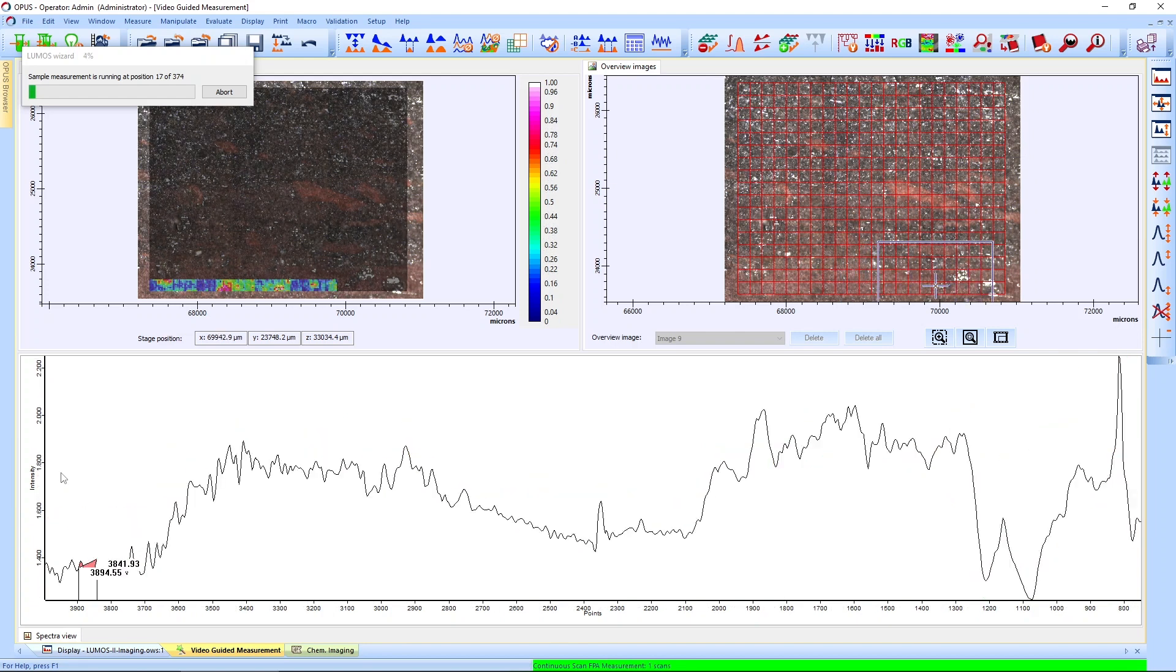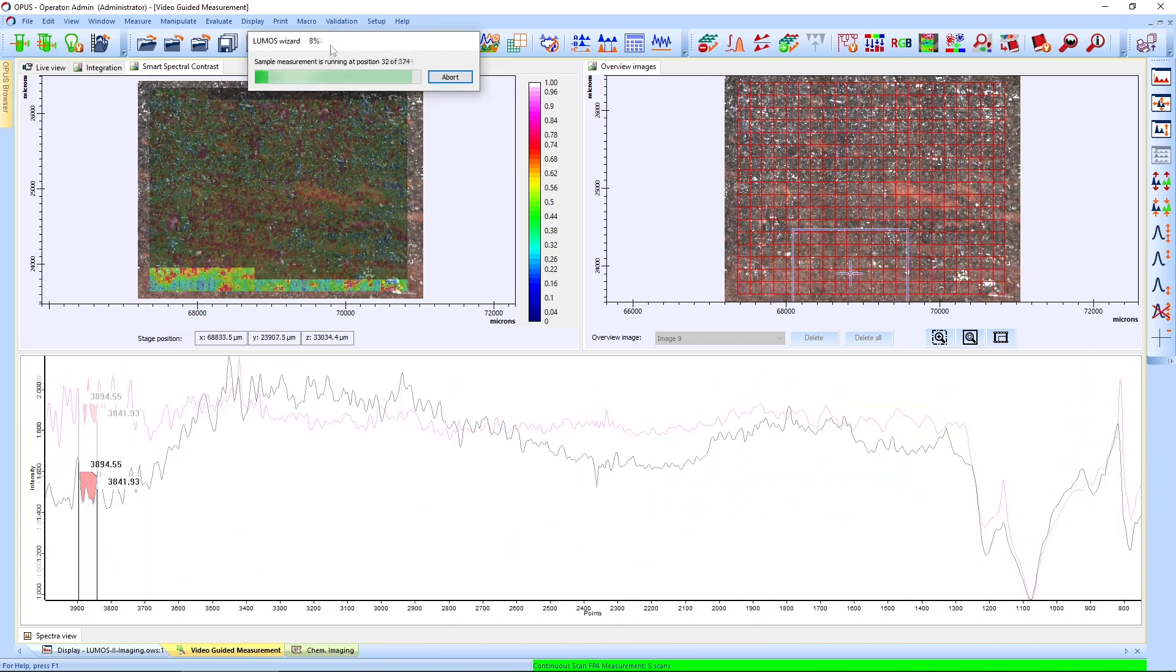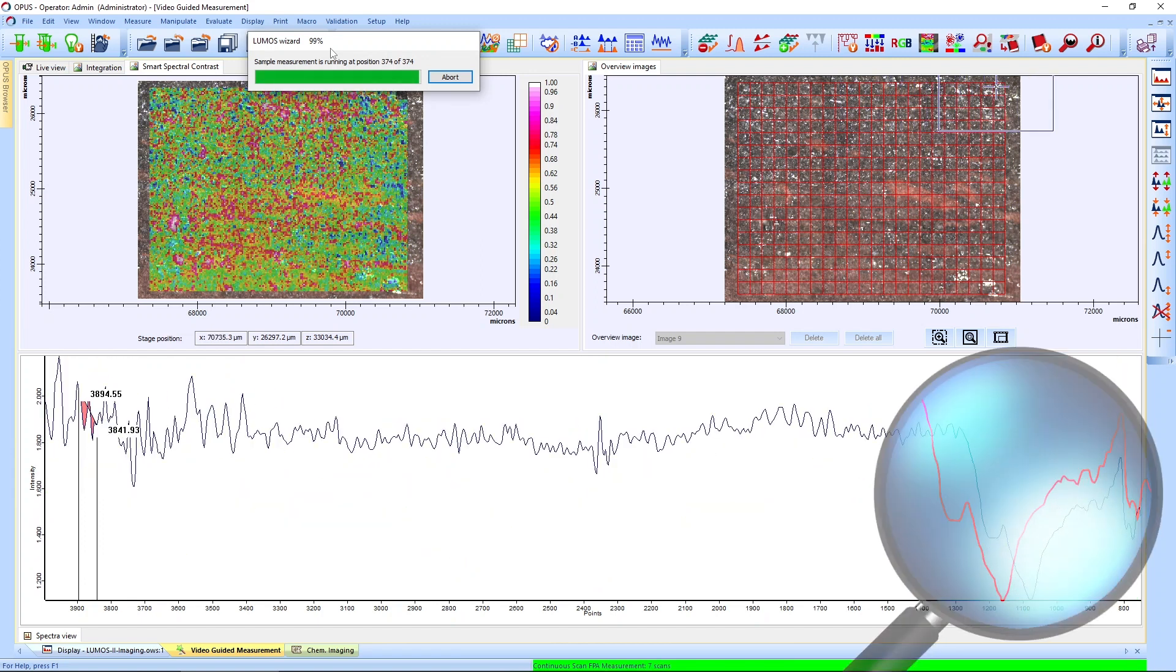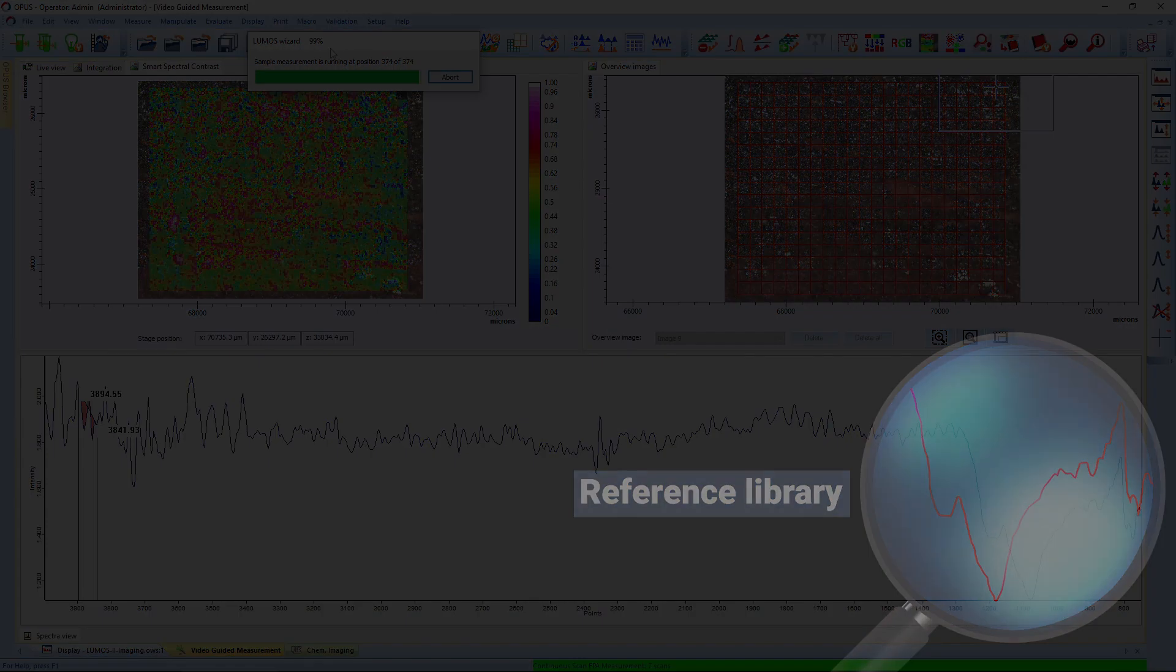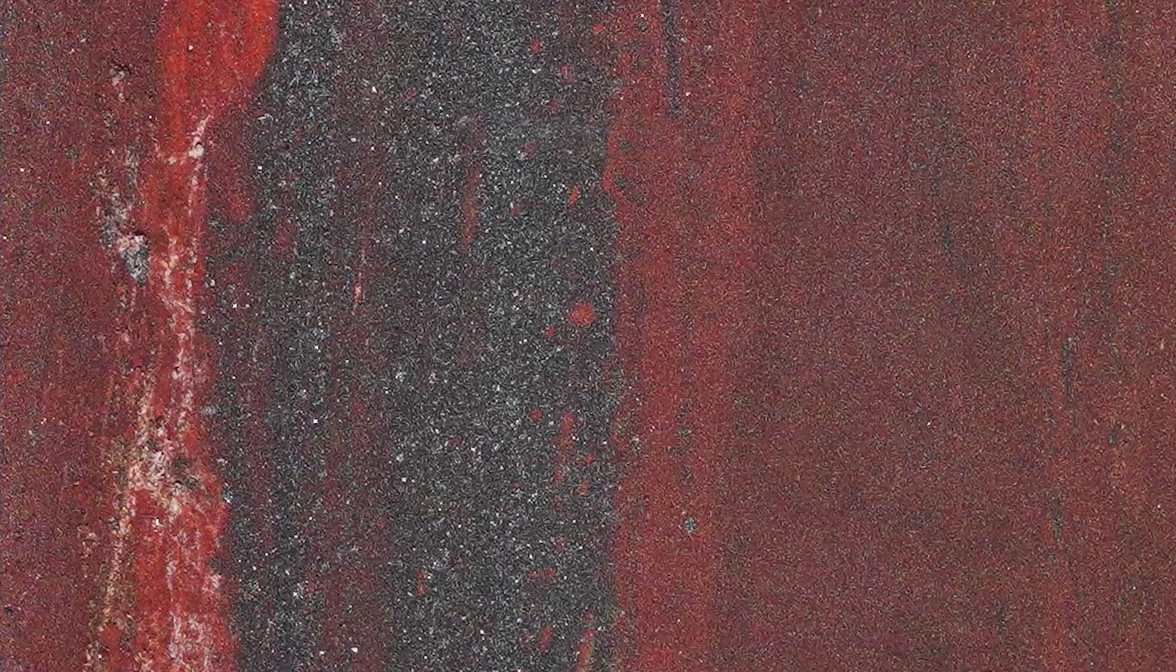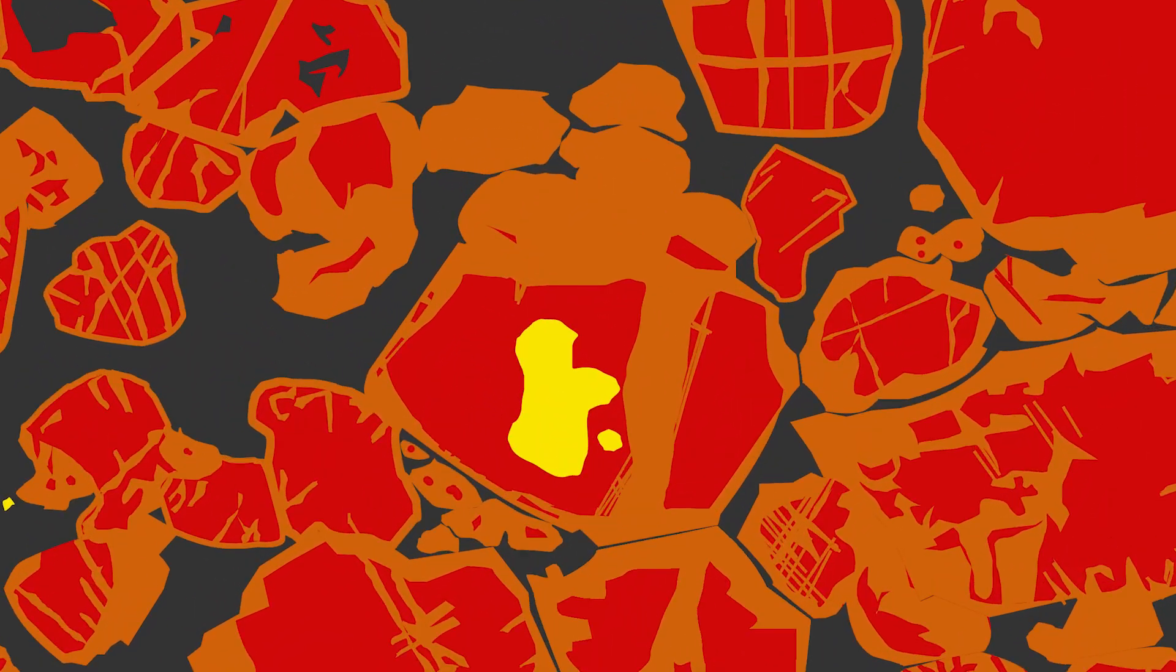As you can see, the creation of the chemical image only takes about an hour. After the mapping is done, the comparison of the measured spectra with the library allows us to determine the mineral identity.